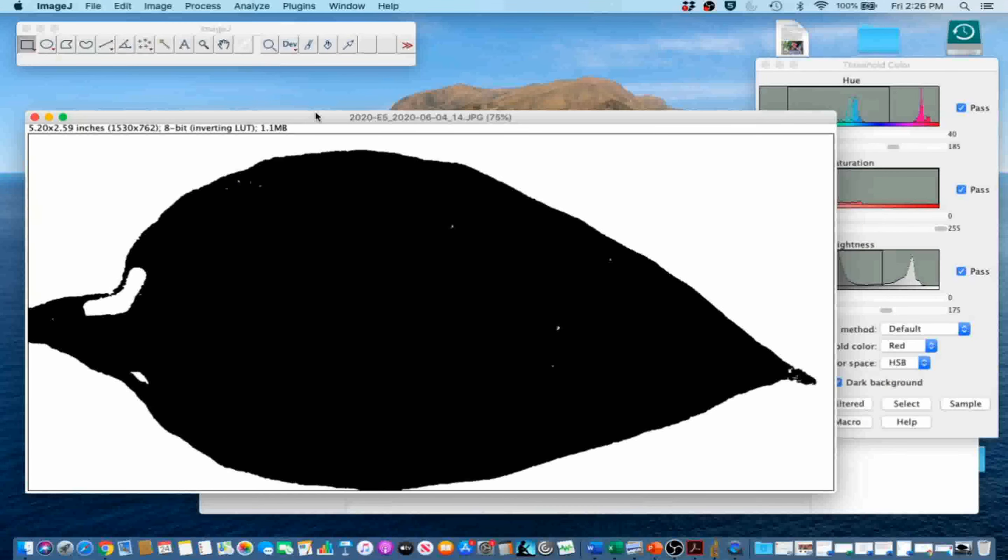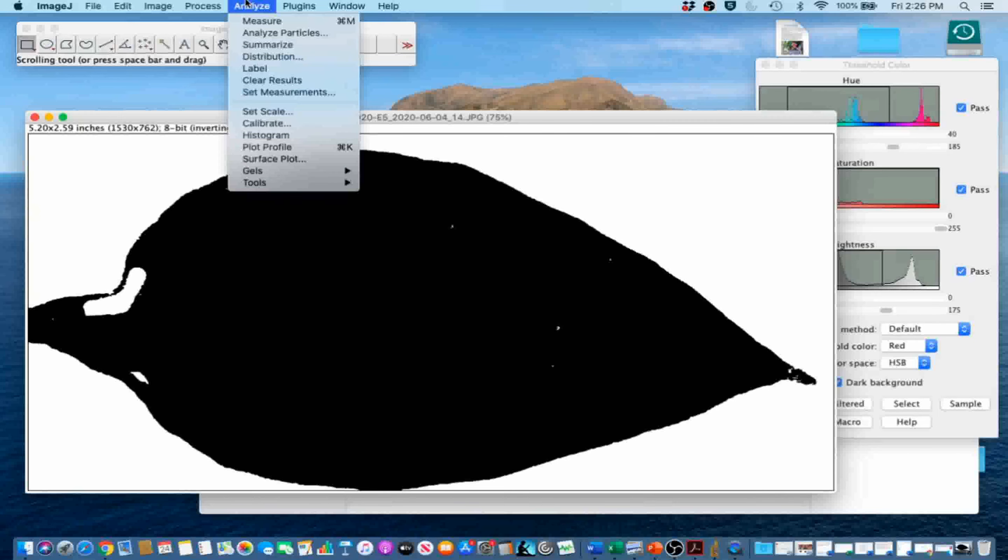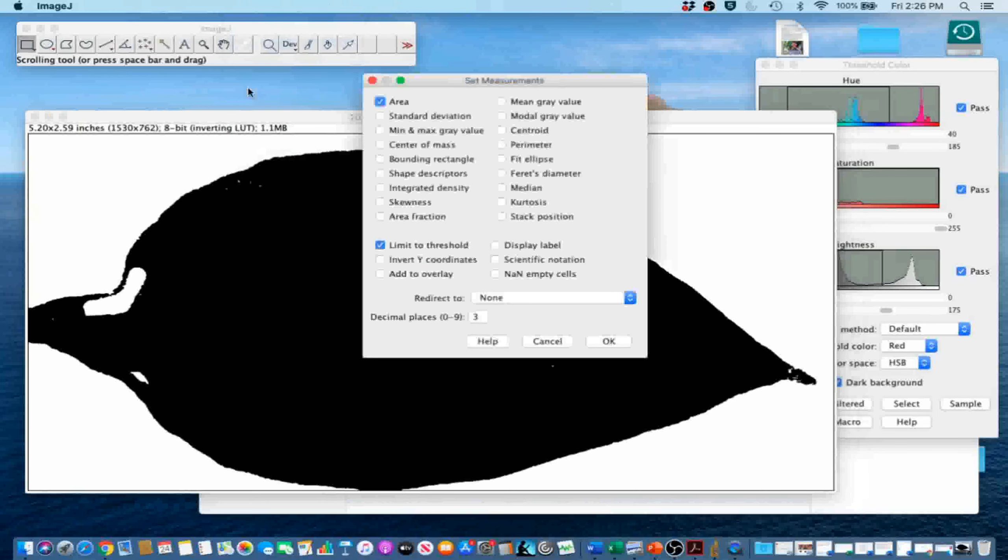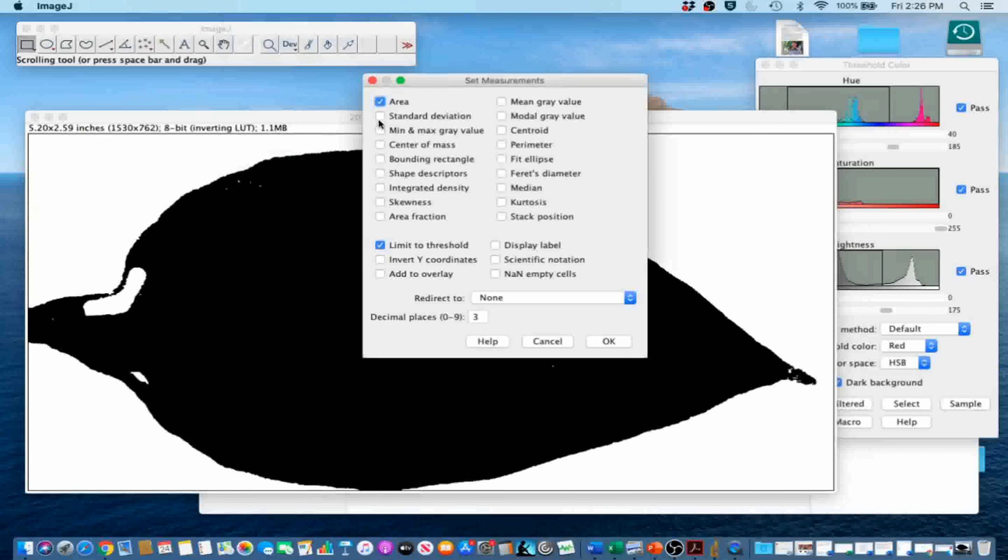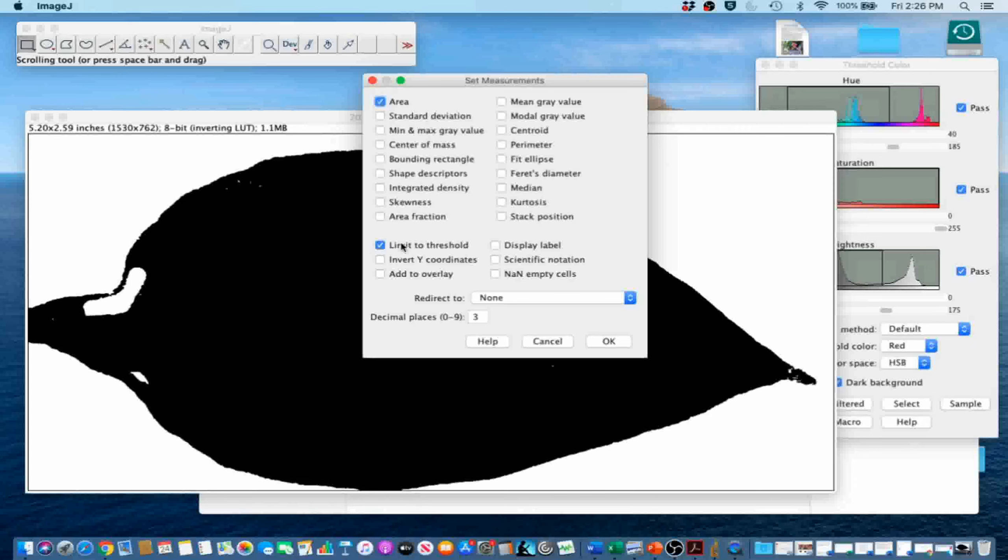In order to measure the leaf area, first go to Analyze, Set Measurements to select the measurement variables that you want. In this case, we want Area and Limit to Threshold. Go ahead and click OK.